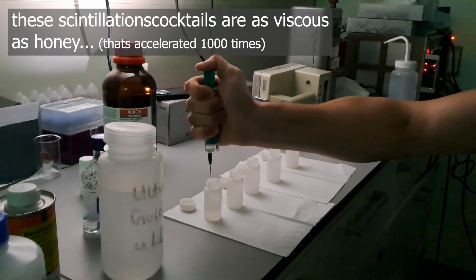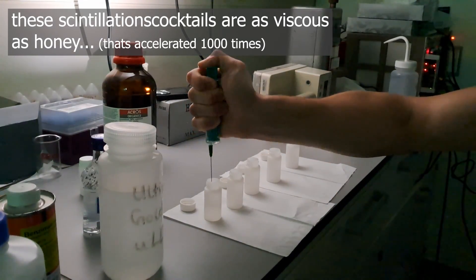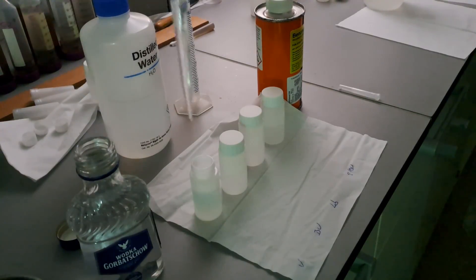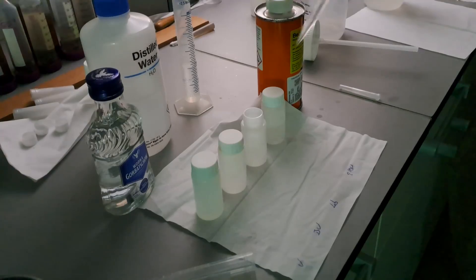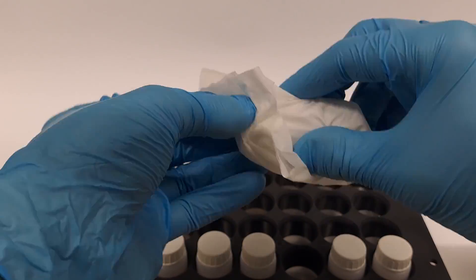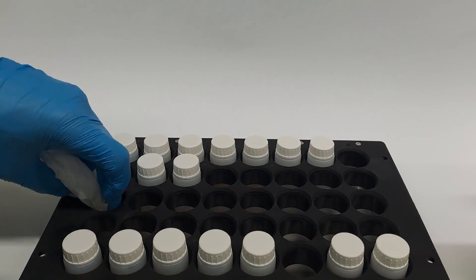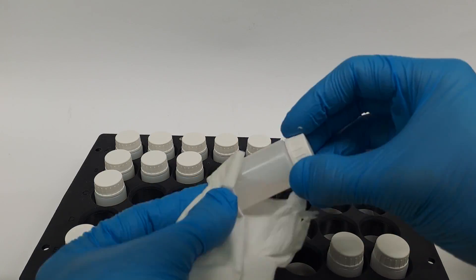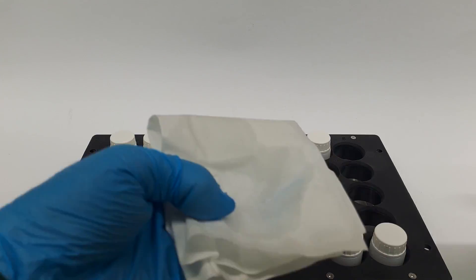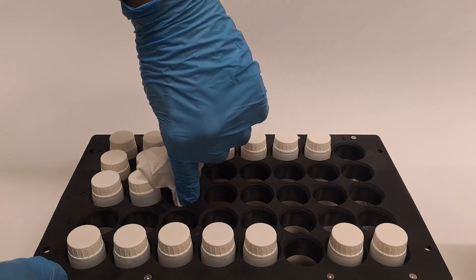In these vials, 12 ml of the ULLT scintillation cocktail were added. In addition to that, either 4 ml of vodka, 4 ml of water, 4 ml of laboratory ethanol previously diluted to 37.5%, or 4 ml of benzene. As an additional background measurement for benzene, another vial with 16 ml of just the scintillation cocktail was added.